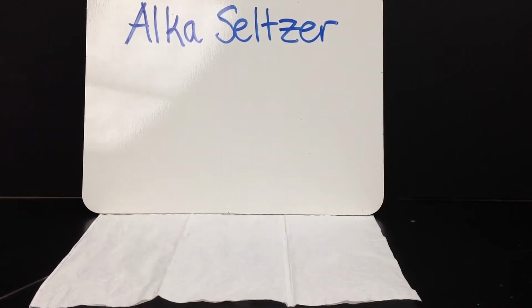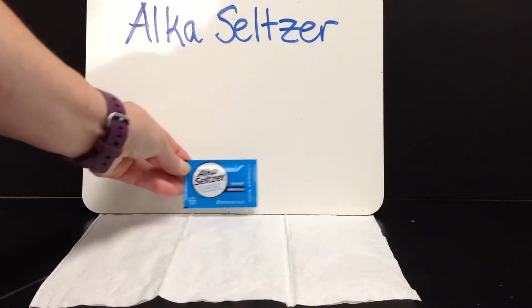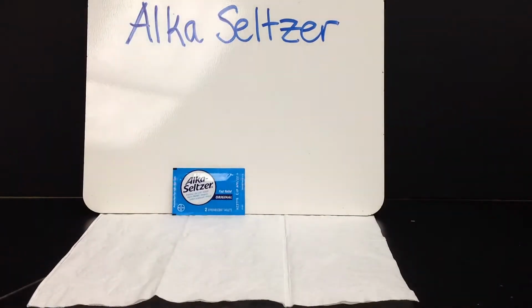This video is recording some observations about Alka Seltzer. We use this for stomach aches. We can dissolve it in water and it will make you feel better. So let's take some observations.